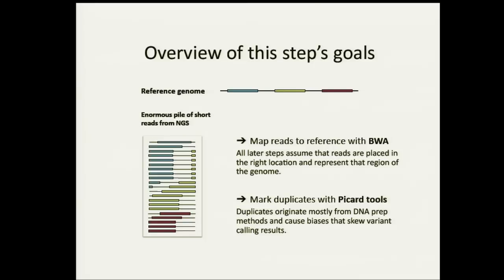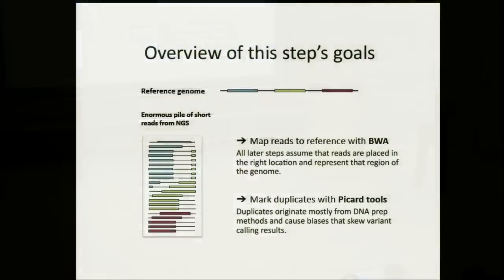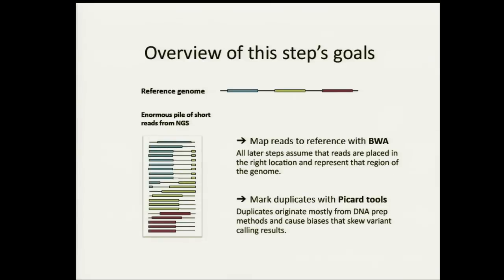In this presentation, you will see BWA a lot because that's the tool that we use. It's a tool that's developed here at the Broad by Heng Li. But nothing is specific to BWA. We do operate with other aligners. It's just that BWA is what we use, and we obviously will be more comfortable with the error modes of BWA than other aligners. But the GATK is aligner agnostic to a certain extent.